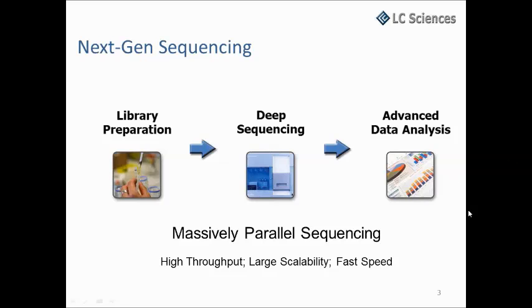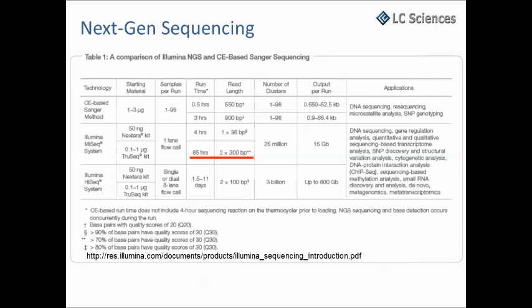And data analysis is the most important part now, because we have standard sequencing platforms. But in order to get meaningful biological information, we must do the data analysis. With those bioinformatics tools, we can derive the biological information from the sequencing reads.